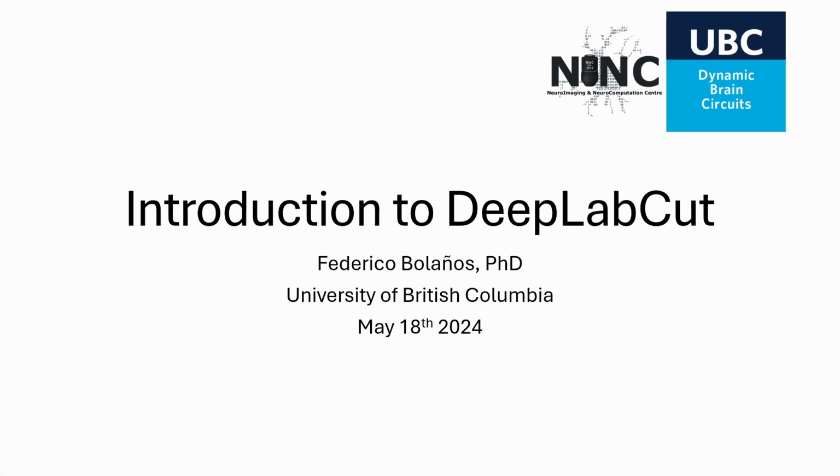All right. Good morning. So I'll give you a quick introduction as to what DeepLabCut does. I think probably most of you might have already heard of it, so it'll be quite quick.